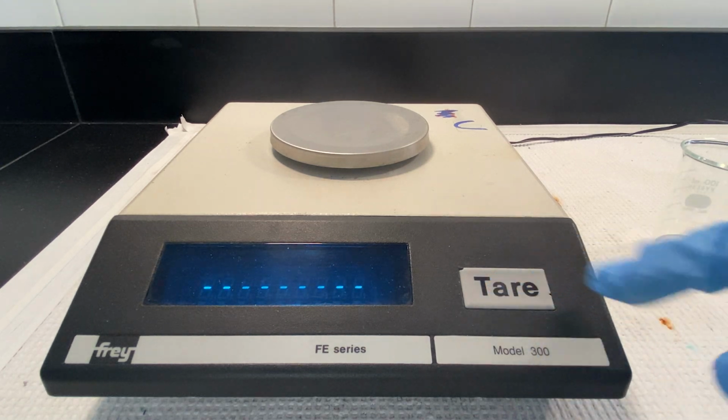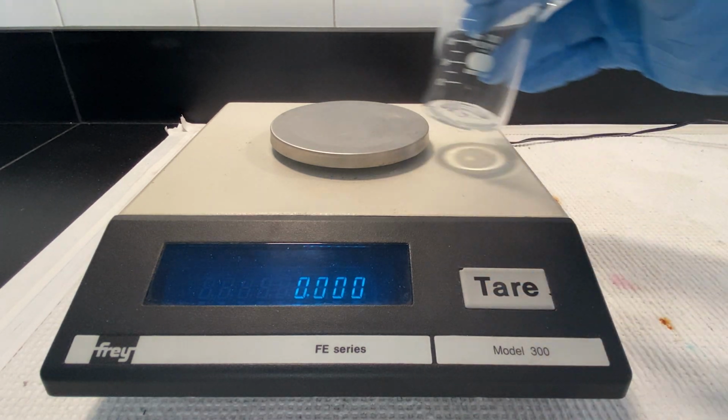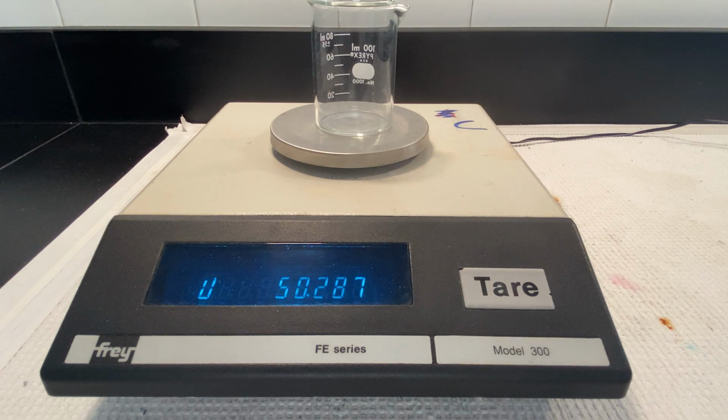Moving now to part C, you're going to make an analogous experiment, this time using a Mohr pipette.